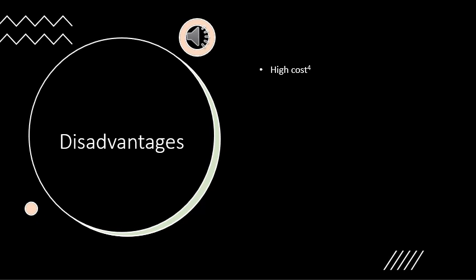For example, a His-tag capture sensor, which binds polyhistidine-tagged molecules, costs around 1500 USD. And this is just a sensor surface for a specific purpose. Couple this with the fact that these sensor surfaces are not reusable, as cleaning them or introducing buffer solution cannot guarantee a completely fresh sensor surface, and you end up with quite an expensive technique.